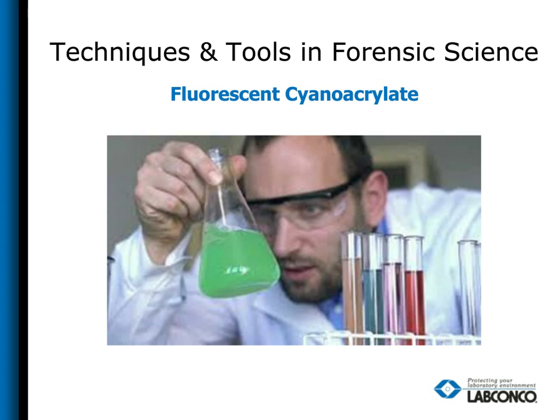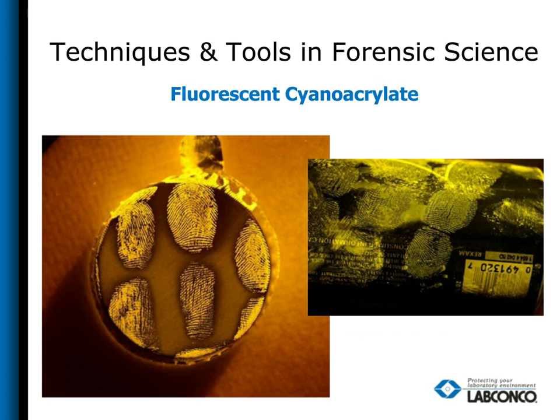I've tested several of the brands, and here are some results of some of our tests using the BT capture chamber. What we have found out, though, in our testing and the use of these different infused dye stain cyanoacrylate formulas, is they are very, very sensitive to temperature, humidity, and time. They're sensitive to the point that if you try to use these in a lot of the different automated chambers out there, which we've used several different brands, you will not get the same results. And a lot of times they won't even fluoresce at all.